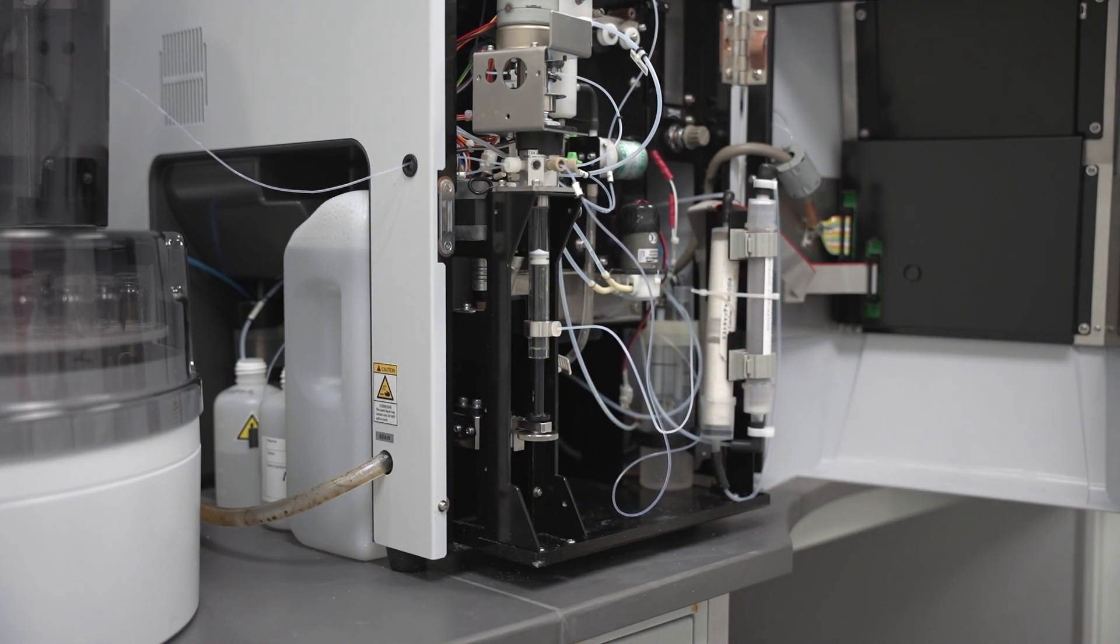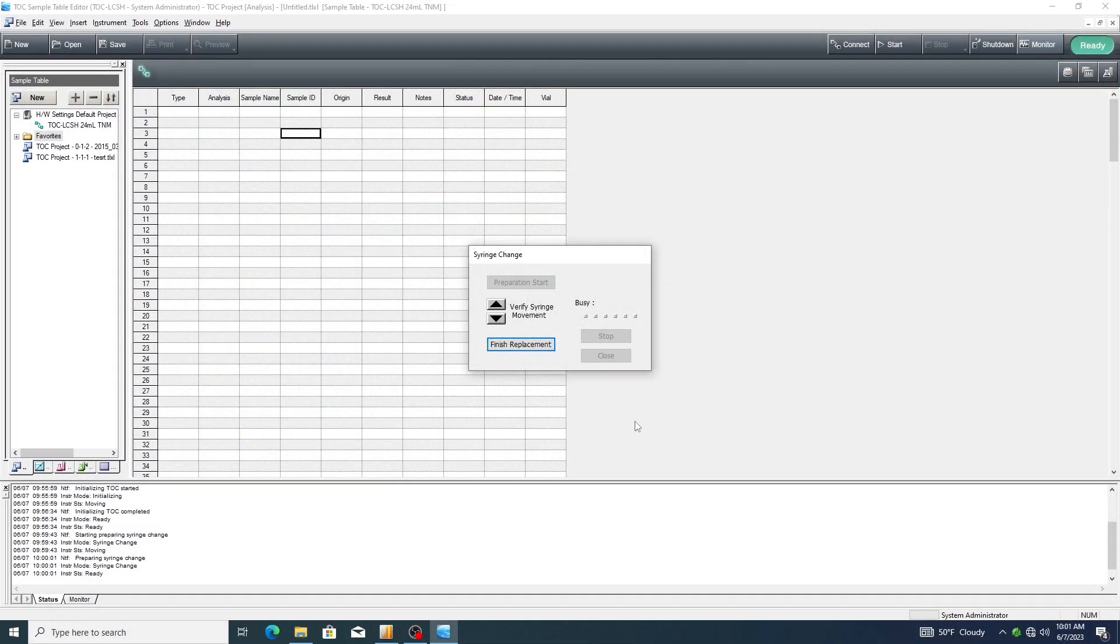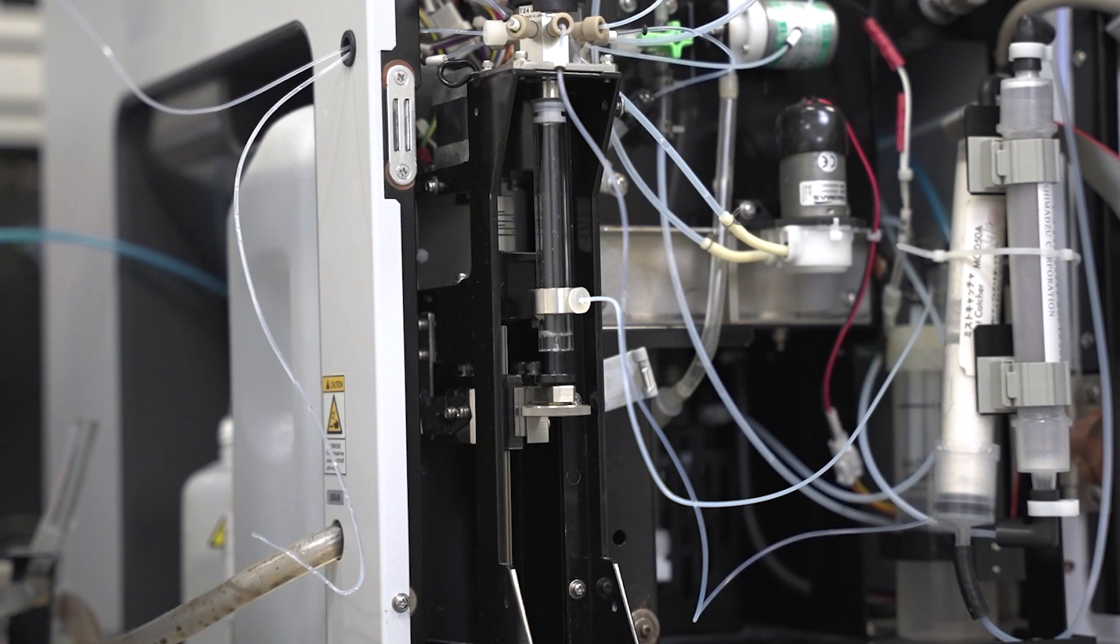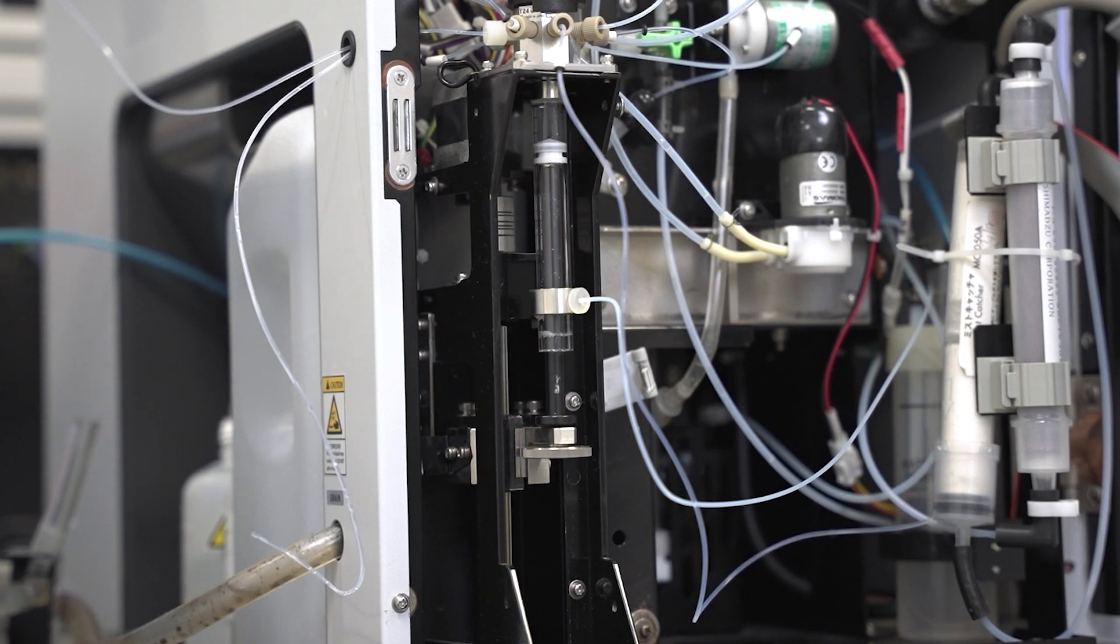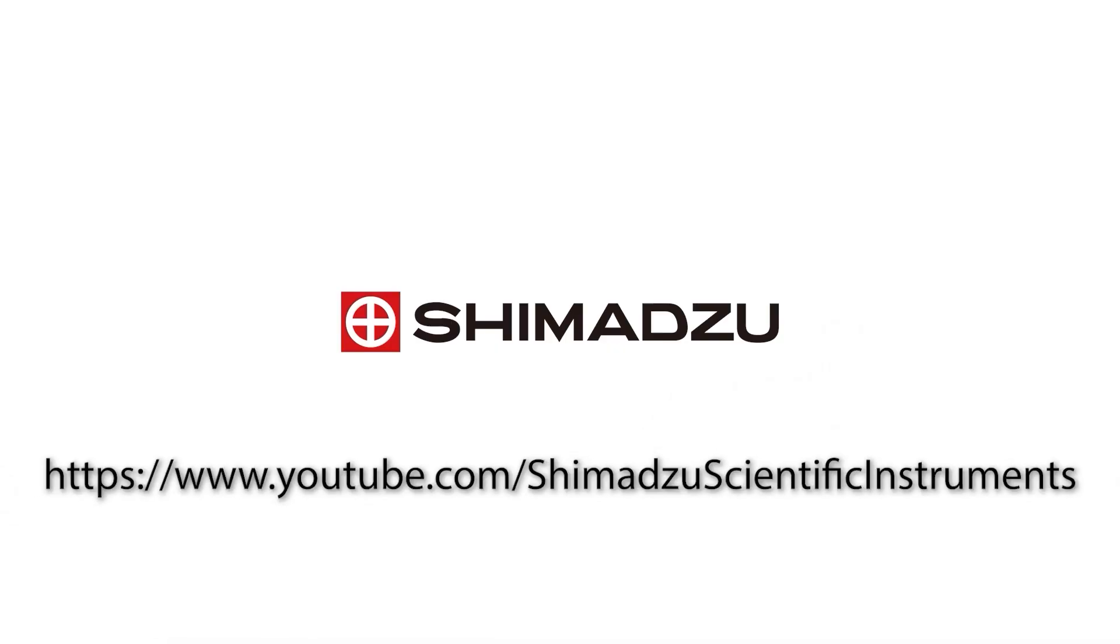Now that this is complete, you can select Finish Replacement. The instrument will perform the zero-point-detect procedure used to calibrate the syringe.